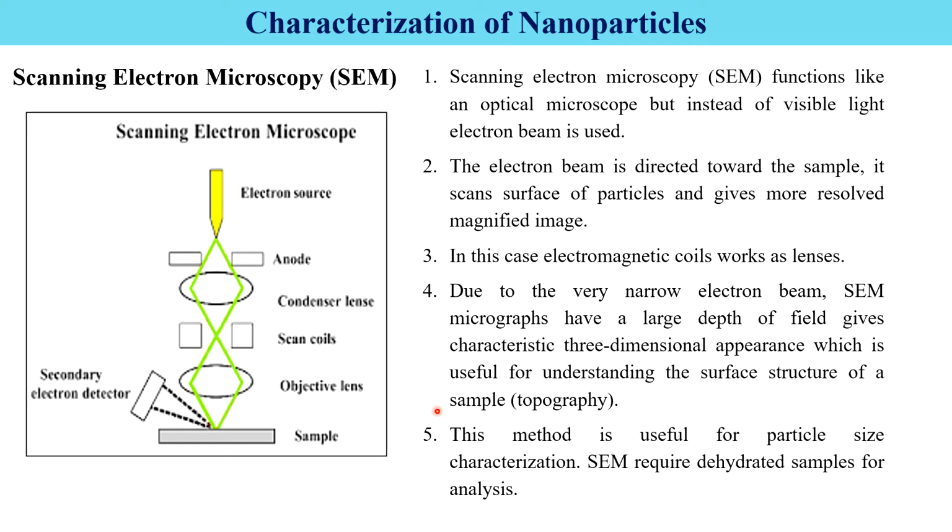This method is used for particle size analysis, that is particle size characterization, and the important point to note that for SEM, the dehydrated sample is used for analysis. This is the most important for SEM, and it is used to determine the particle size.